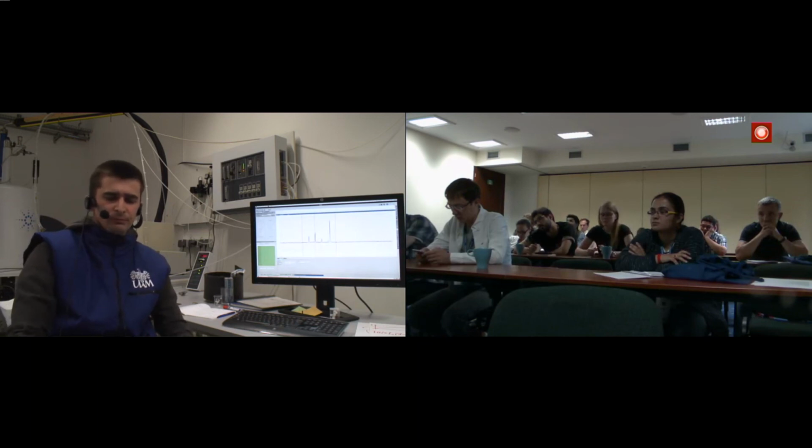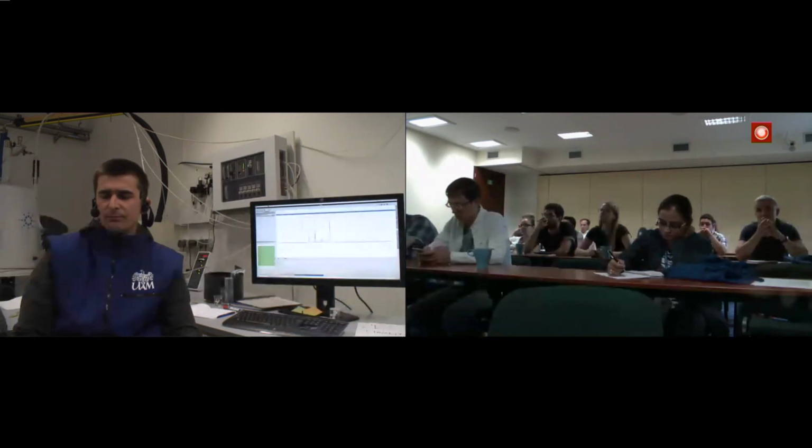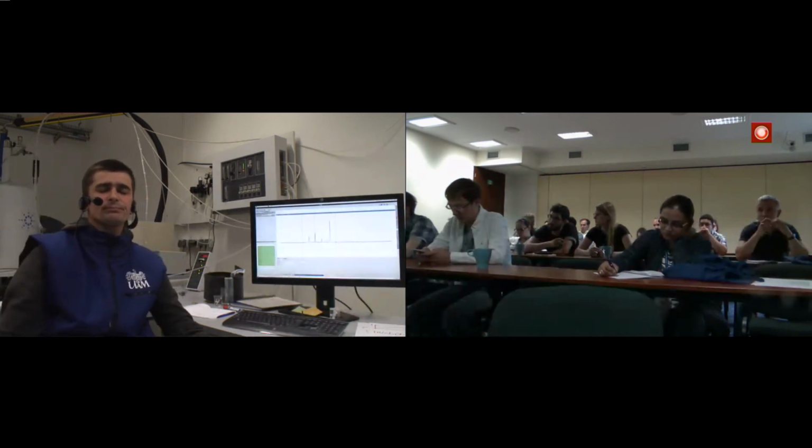Second is relaxation. We should wait a long time, five times T1 of the methyl group, and the same is not true for the other types of carbons, and therefore the spectrum is not the simple summation of the number of nuclei precessing in space.